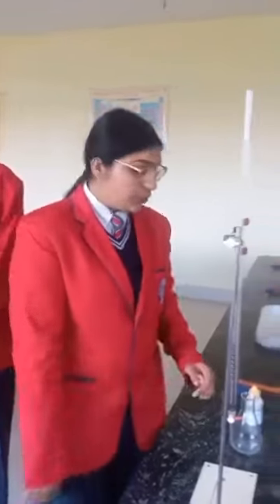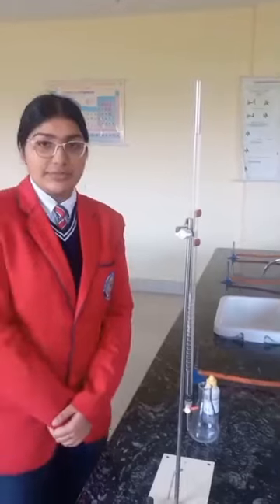I am Praveen. We are the students of class +1 science from the Unitized World School. Today we are going to perform volumetric titration. We are going to titrate M/20 solution of sodium carbonate against HCl to find the molarity of HCl.